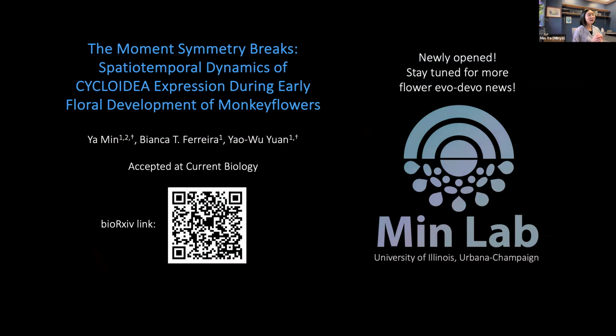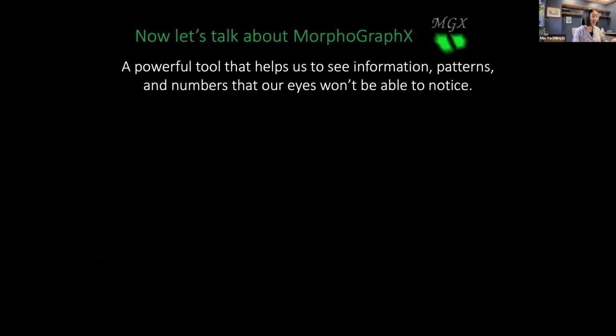But now I've finished my spiel, let's talk about MorphoGraphX. I first got to know this software a few years ago during grad school, and it really became a very important part of many of my imaging work. Because as I demonstrated just now, it's a very powerful tool that helps us to see the information, the patterns, and the numbers that our eyes won't be able to notice.